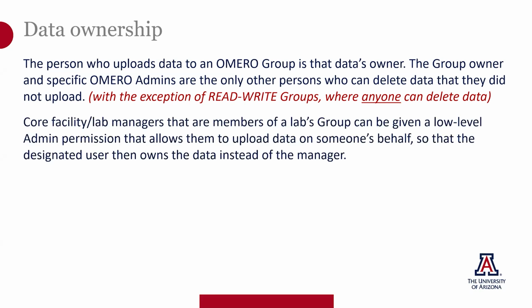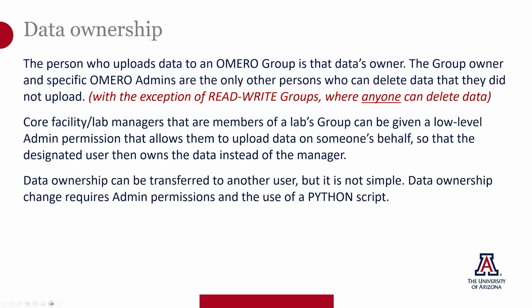If you as a group owner have a lab manager in your group or you work regularly with a core facility, there's the possibility of using a low-level administrative permission that allows specific people to upload data on someone else's behalf. This allows the designated person to become the owner of the data instead of the person who actually physically uploaded the data. Data ownership can be transferred to another user, but it's not simple.